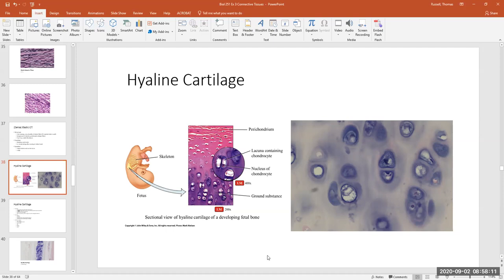Cartilage is somewhat pliable — one type is very strong and sturdy, but it's not hard like bone. It's almost like a rubbery type of consistency. Looking at the diagram, this is a slide taken from a fetal skeleton. When we are developing in utero, our entire skeletal system starts off as being hyaline cartilage, and this cartilage has to be converted into bone.